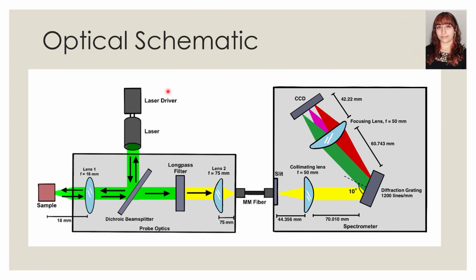For our optical layout, the laser source is directed at the dichroic mirror, which will selectively reflect the laser line into a focusing lens that focuses the beam into a 10 to 20 micrometer spot on the sample. This generates Raman shifted photons in all directions, which are then collimated by the same lens and directed back towards the dichroic. The dichroic will transmit the Raman shifted photons while reflecting nearly all other wavelengths, upon which a long pass filter will fully isolate the Raman signal.